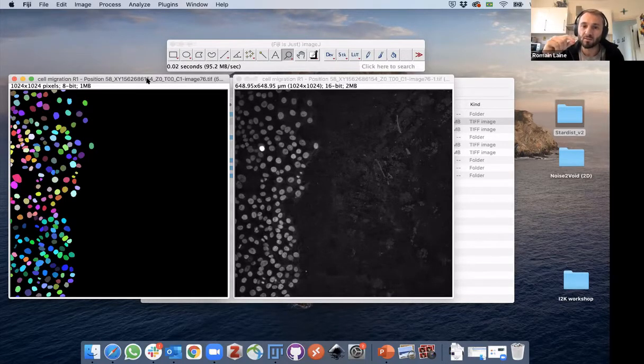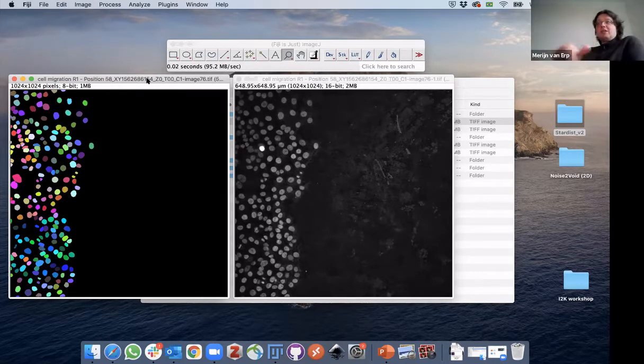It also gets a penalty whenever it fails to identify an object, and it also gets a penalty and learns from it if it identifies an object but identifies its shape wrongly. And that's how those penalties help the neural network to tune its own parameters to slowly improve and get towards the target image. Okay, so it gets penalized every time it gets anything wrong, and that's the iterative process effectively, right? Yeah, I was kind of wondering how that kind of a learning function would work, because with pixels it's clear it's right or wrong, and here you have multiple different features that you can work with.